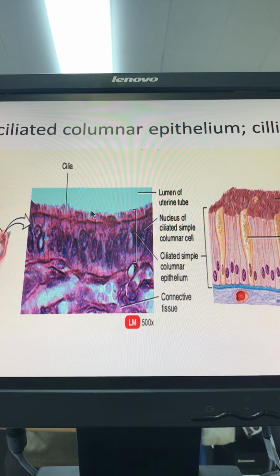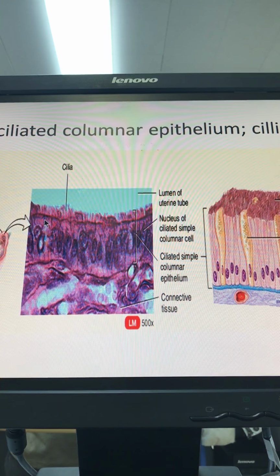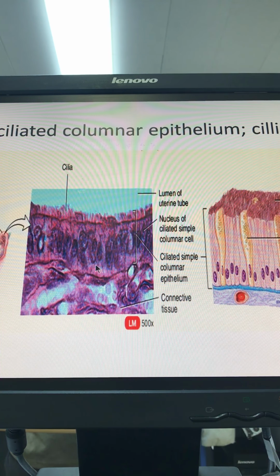We said the cell membrane cannot be seen within the light microscope. So what is visible here in between cells? Yes, it is junctions. And I can see here, this represents actually the two cell membranes, adjacent membranes with the proteins and lipids in between. Proteins with extracellular substance here. Actually, these are junctions here, apically. Here also, two cell membranes with the extracellular matrix in between and the proteins in between.